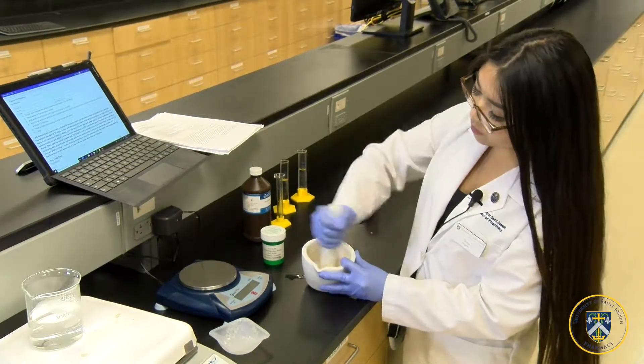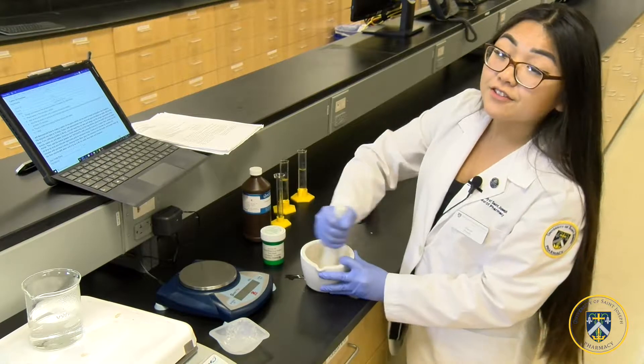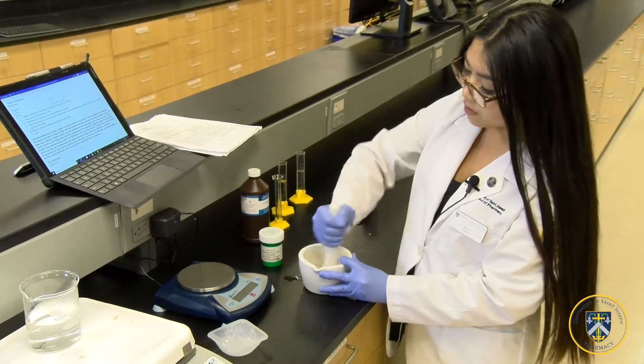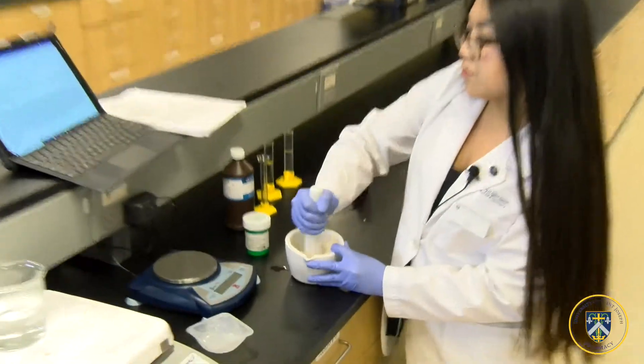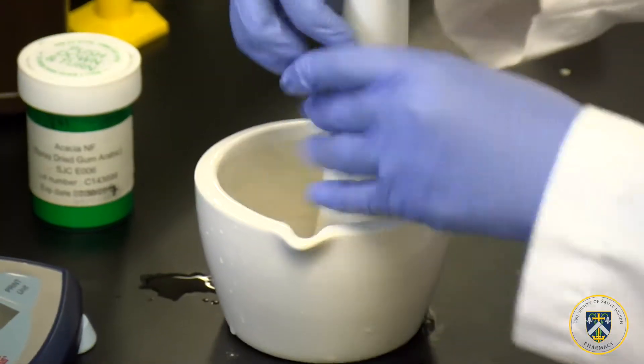This is a wet gum emulsion because the water is the base first. Then I'm going to add oil drop by drop into the mortar and triturate it until a smooth mixture is created.